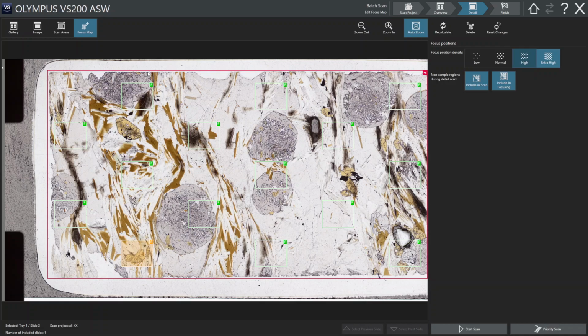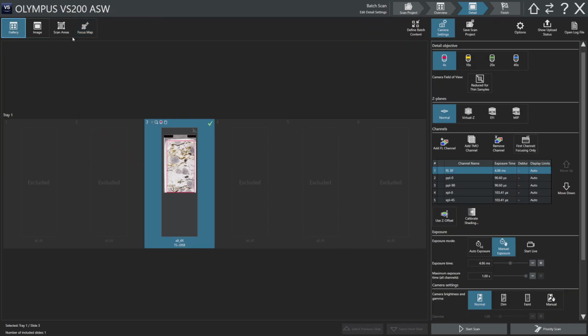We can see that there is a variety of mineralogy that will require exposure settings to be set up as constant values, and that will be automatically done for you. Here, for example, you have listed the modalities that you want to use, including reflected light, plane polarized light, and cross polarized light. They all have specific settings, such as the white balance, shading corrections, and distortion corrections done by the software itself in the background during calibration settings.